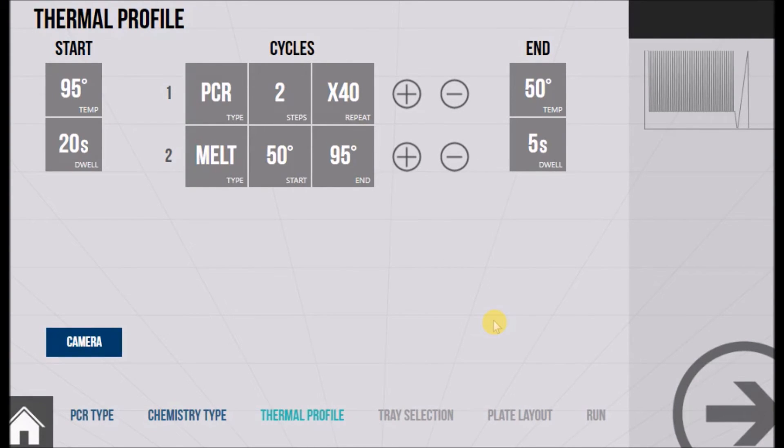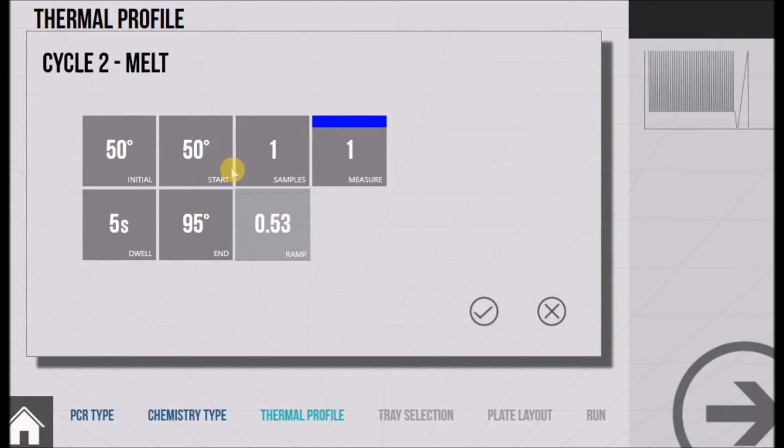There's also the option to perform a melt at the end of the PCR reaction. Again, you can alter the parameters for this just by touching.